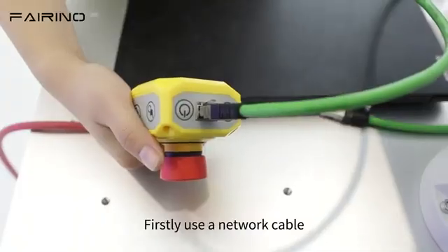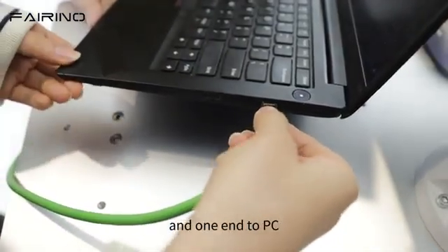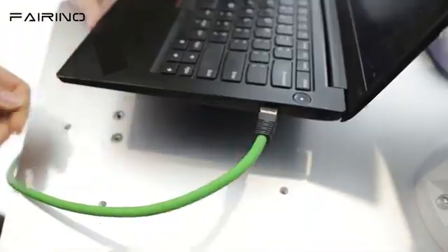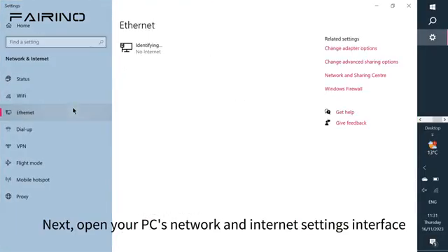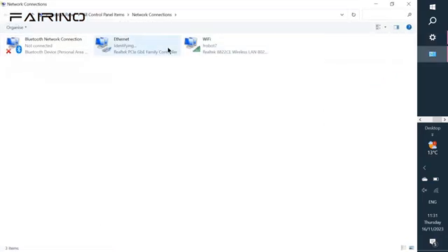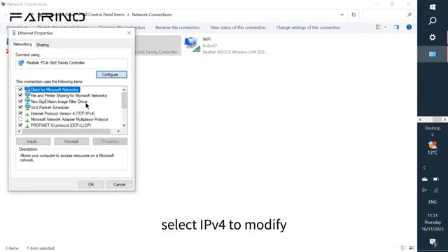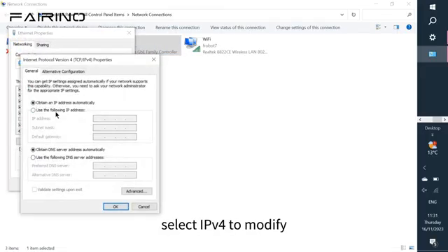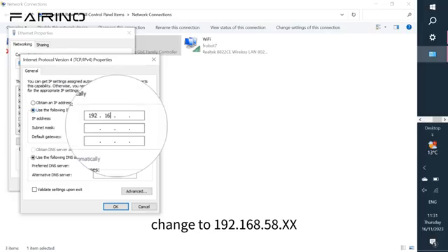Firstly, use a network cable to connect one end to the internet port of the button box and the other end to the PC. Next, open your PC's network and internet settings, select Ethernet, change adapter option, select the connected Ethernet, right-click its properties, select IPv4 to modify, and change to 192.168.58.xx.